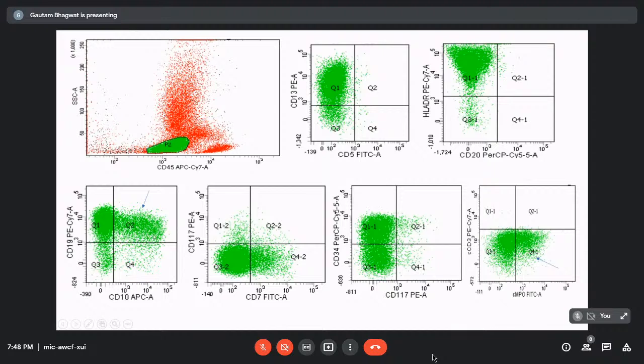What I have here is CD19 and 10 co-expression. So one is CD13, one is CD19-10 co-expression. You have CD34 positivity, so CD34 HLA-DR positive. It is an immaturity marker, acute leukemia done, but we have one myeloid marker. 19 and 10 are the B lineage markers, and what I find here is cytoplasmic MPO, which is a myeloid marker. So what do I have here?